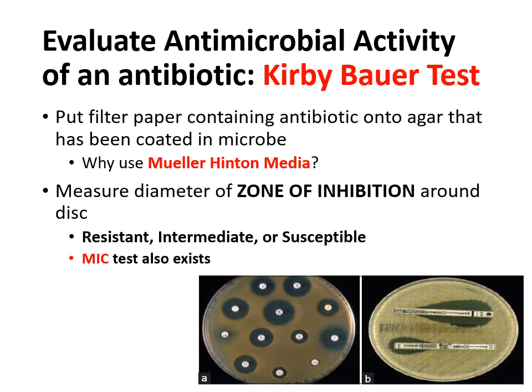There's a lot of variety in terms of different bacteria having different susceptibility and resistances. So in order to evaluate how good a job an antibiotic would do at killing a particular bacteria, we do the Kirby Bauer test, which you see in the figure below as letter A.